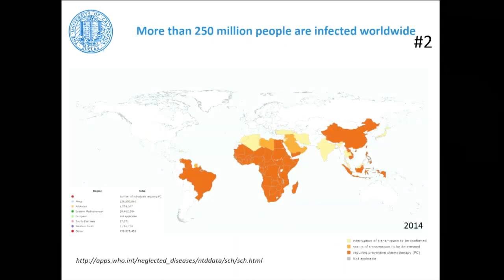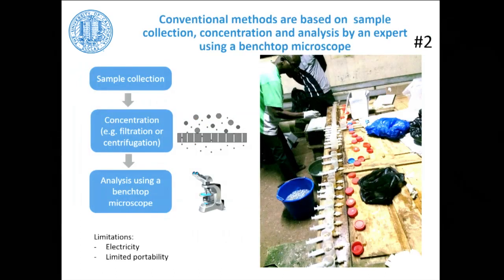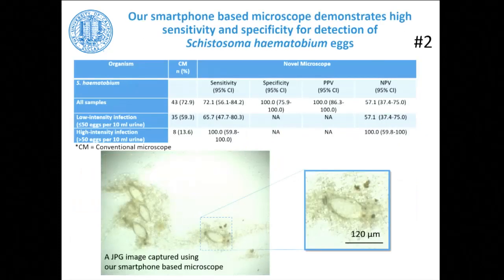It affects 250 million people worldwide. 35% of the population in Ghana has been said to have schistosomiasis at some point in time. Unfortunately, most of these people are school children, 40%. So we were able to take this transmission-based microscope and look at urine samples and assess and validate the efficacy of determining schistosomiasis in a urine sample, and found that it had 100% sensitivity for high infection rates. Lower sensitivity for low intensity infection rates.